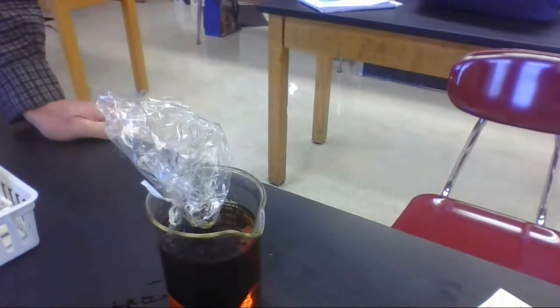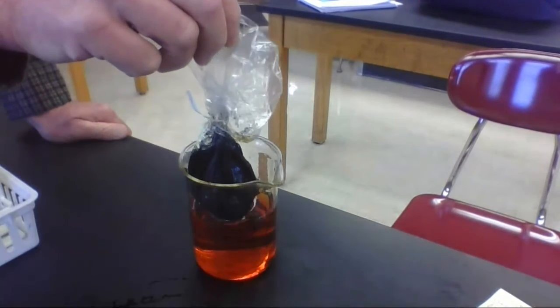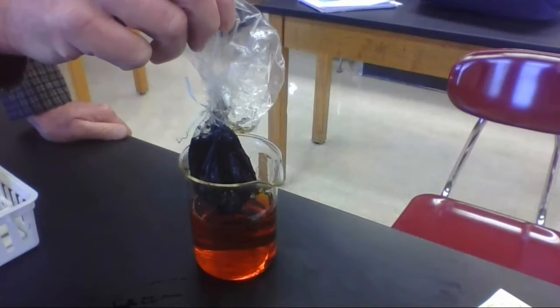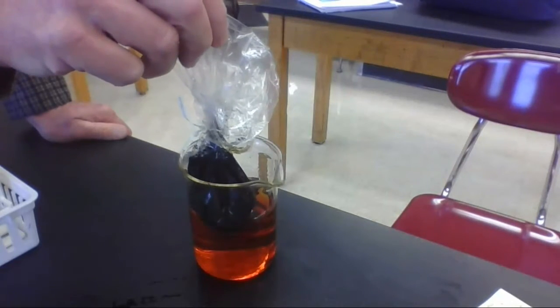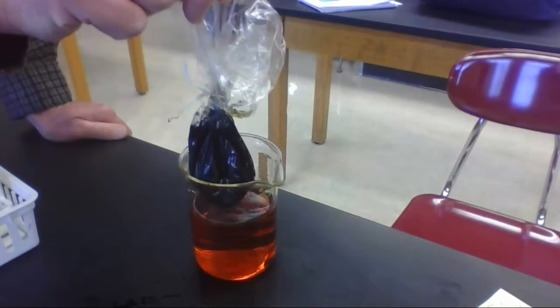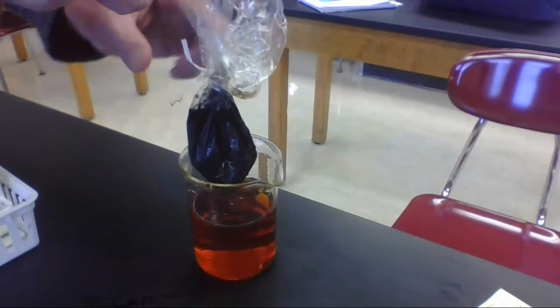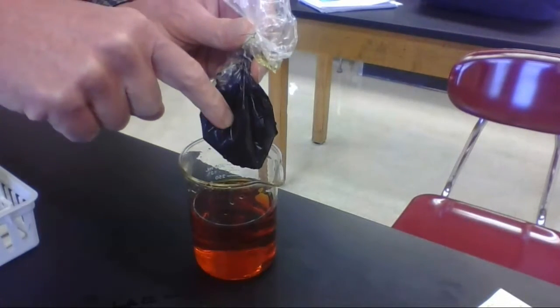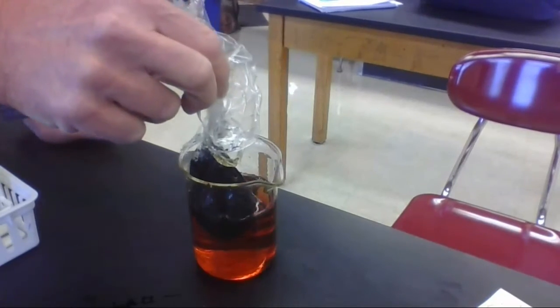From that information, can you explain, was the bag permeable to anything? In other words, can anything get into or out of the baggie? Did iodine go from high concentration in the beaker here into the baggie? Or did starch that was in the baggie go from high concentration in the baggie out and get out into the solution?